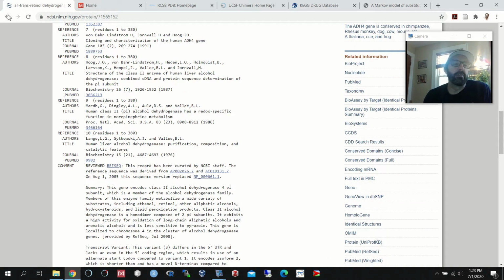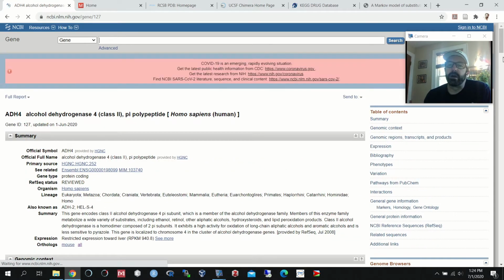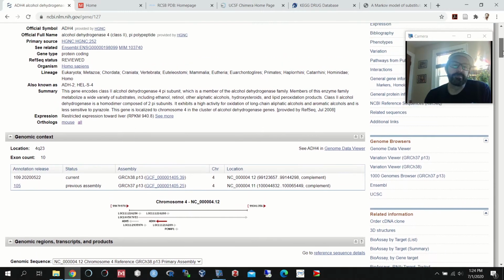Now if I go back over here I can go to the gene page, and here I can get either the DNA or the RNA sequence. In this course, I'm going to encourage you to mostly work with messenger RNA sequences, and this is because of the simple fact that in eukaryotes, the mRNA is essentially very close to the coding sequence of the gene usually. It's because all of the intron sequences have been spliced out of the messenger RNA.